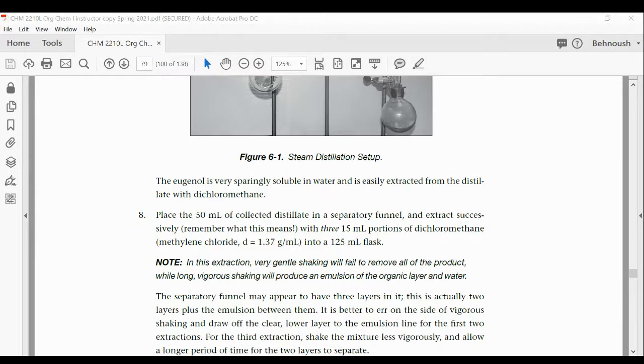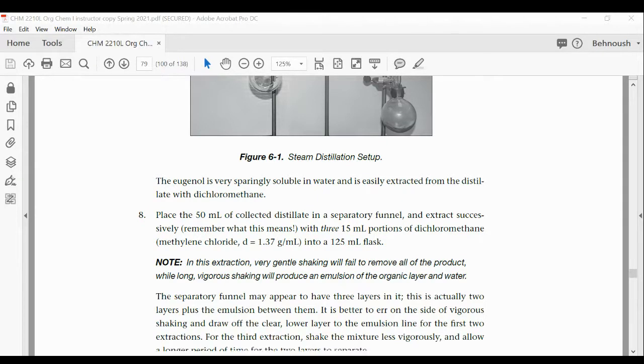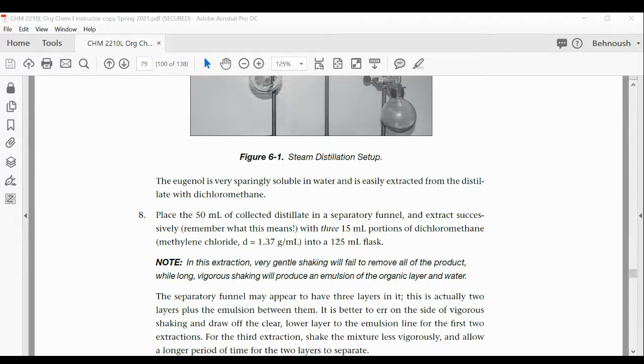It's a drying agent, so it's going to remove any leftover water from the methylene chloride. Very good. It's not to prevent clumping. Preventing clumping is a process, or that's the indication. Very good. I'm glad that you brought that up. It's like how much calcium chloride you're adding. When you add calcium chloride to water, it would clump up.